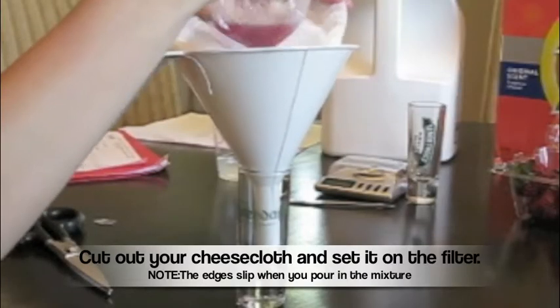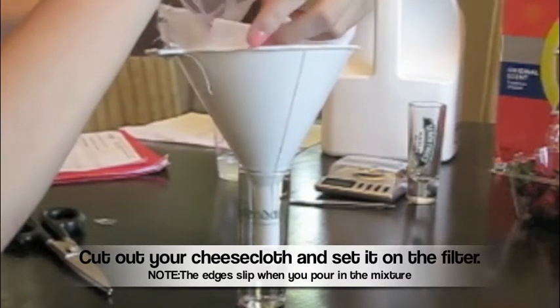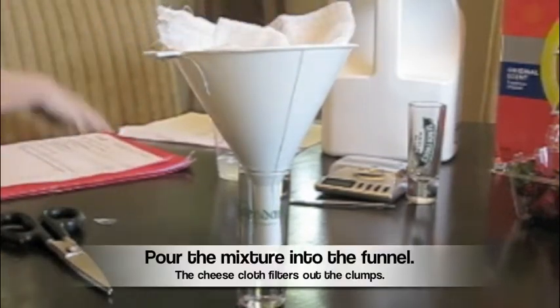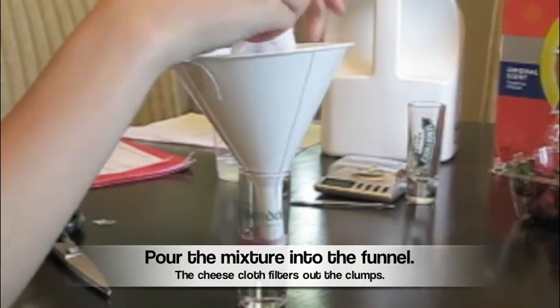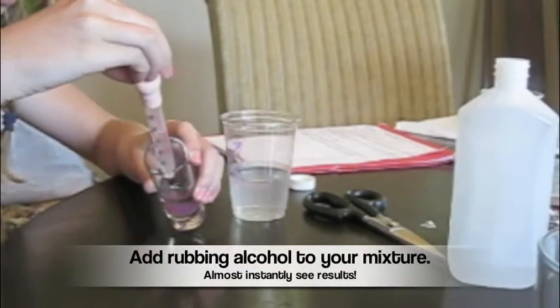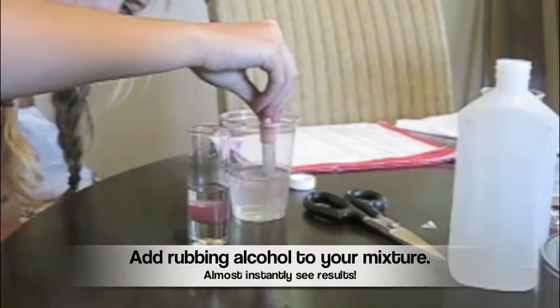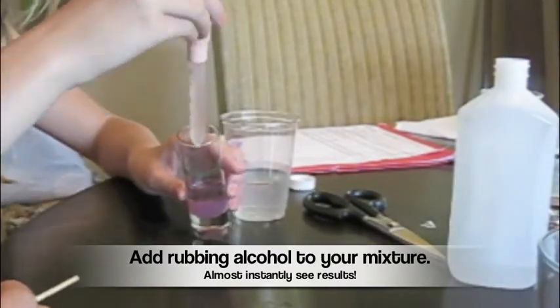Cut out a small 4-inch by 4-inch piece of cheesecloth and place it on top of the filter. Pour the mixture into the funnel. Do not let the edges of the cheesecloth fall in completely. The cheesecloth should filter out the larger pieces of strawberry. Next, you pour in the rubbing alcohol. You should almost instantly see DNA begin to form between the rubbing alcohol and your original mixture.